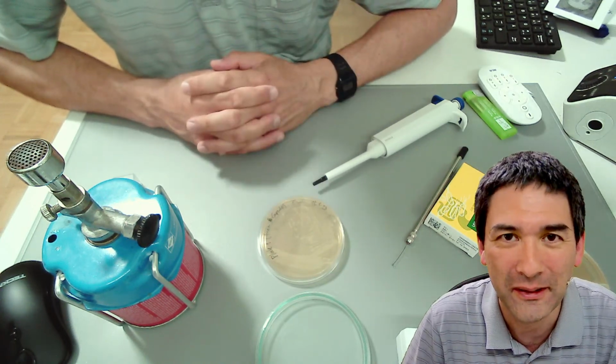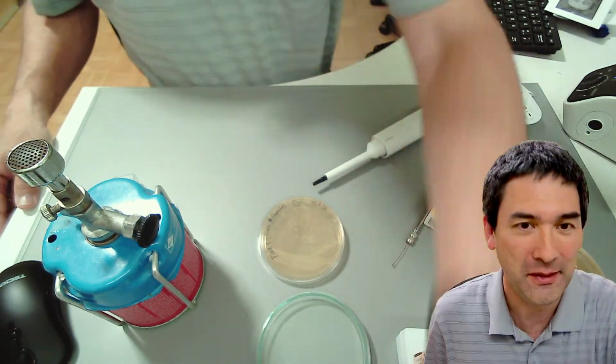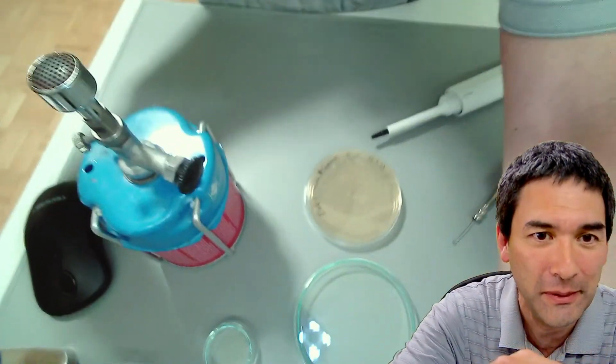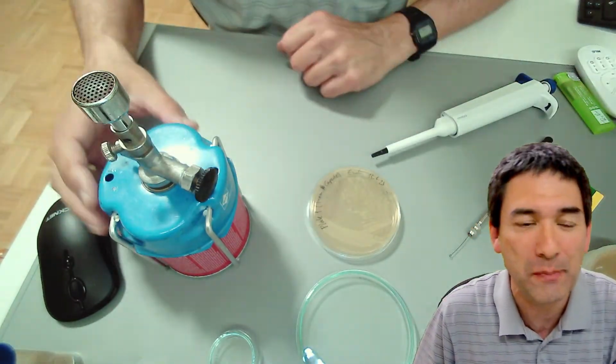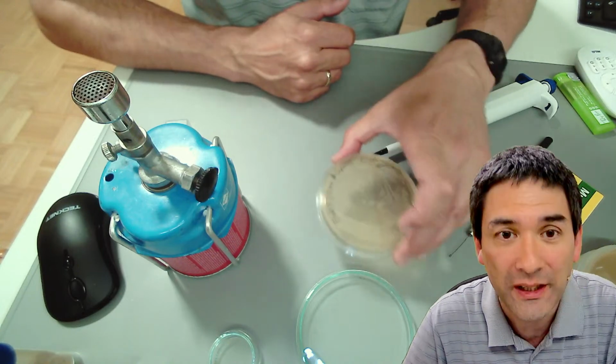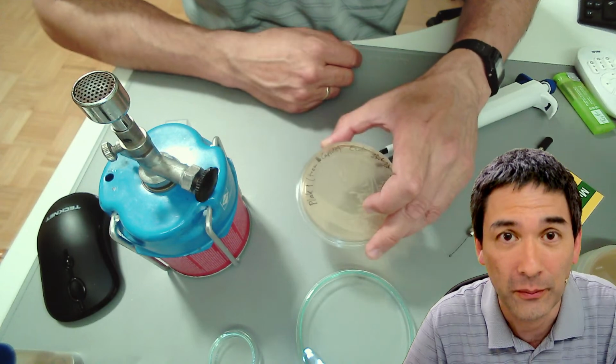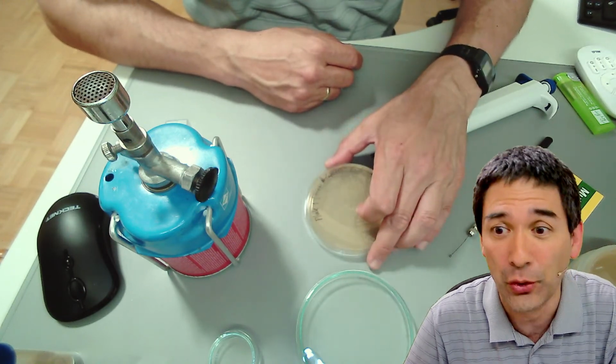Today I'll be doing a little bit of microbiology, of course, also some microscopy. This camera on my desk is set up a little bit different today because I need a little bit more space. Because I'll be showing you how to make Petri dishes with bacteria on it, and of course we'll be putting some of them also under the microscope.